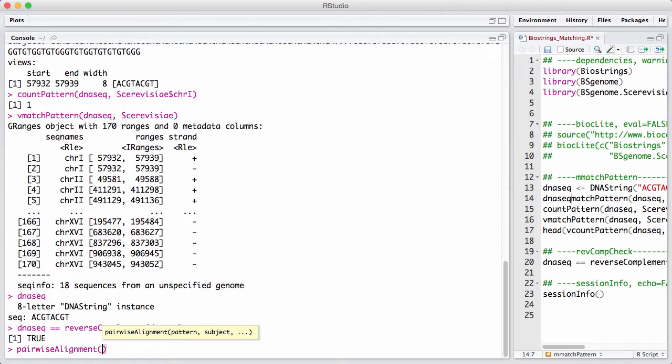But they are still very useful, even if you have millions of reads, as long as you align them up to a very small section of the genome that could, for example, be a gene. This is underutilized, I would say. I could see a lot of interesting applications of this idea.